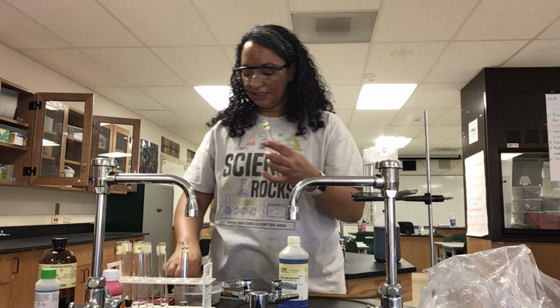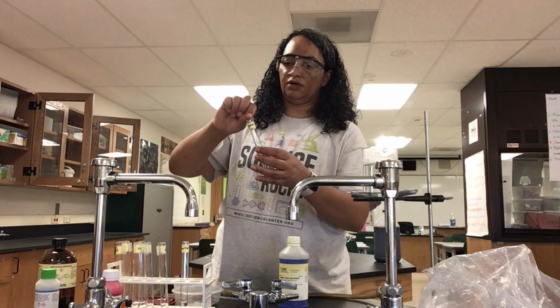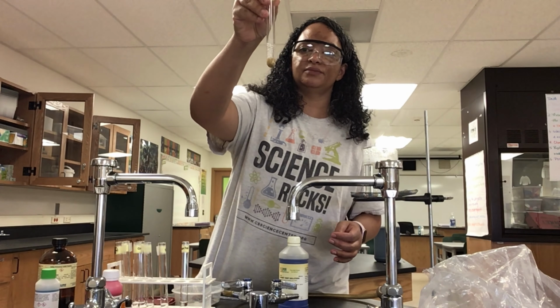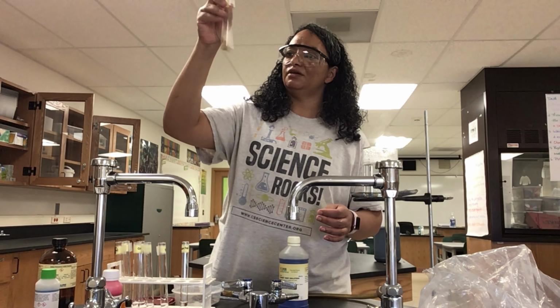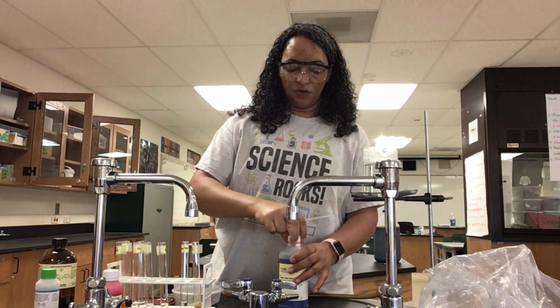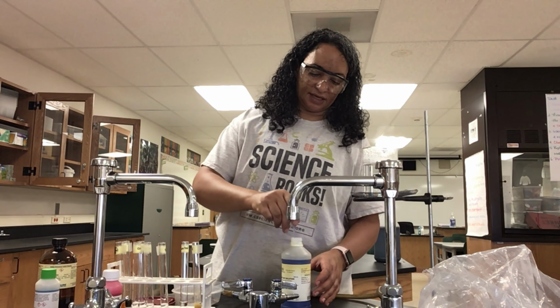So I'm going to take my seed test tube and I'm going to get a chunk of this delicious acorn and I'm going to cram that in there. And I'm going to mix it up so it's kind of at the bottom, so it reminds me a little bit of a chunky protein shake. Blech. All right, I got my new pipetter. I got my Biuret. I'm going to suck some up here.